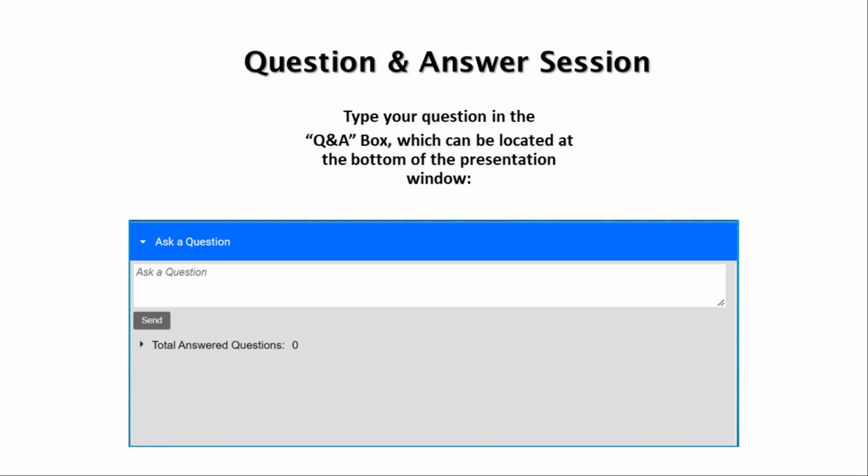Okay, as you're mentioning both 1.5 and 2.1 ID columns, what is the effect on sample loading when moving from the 1.5 to the 2.1 millimeter ID column? Sure. So the sample loading, just like we have the flow rate going from a 2.1 millimeter ID down to a 1.5 millimeter ID, the sample loading would also be halved. Okay, makes sense. Let's see what else.